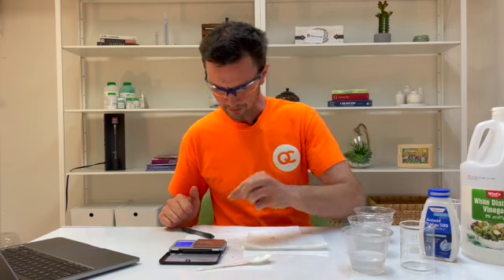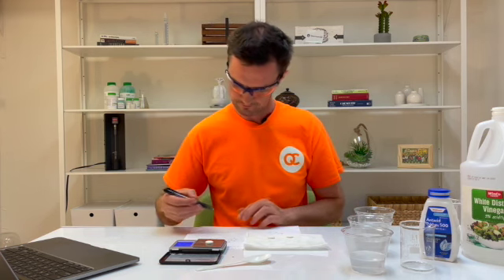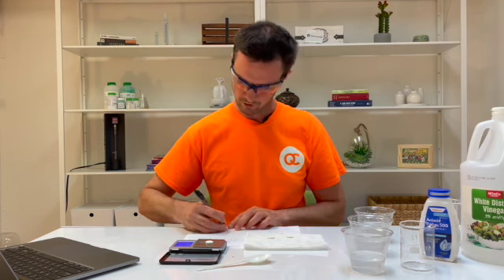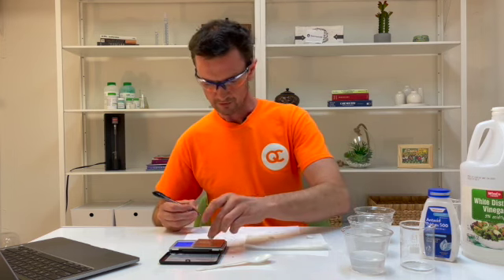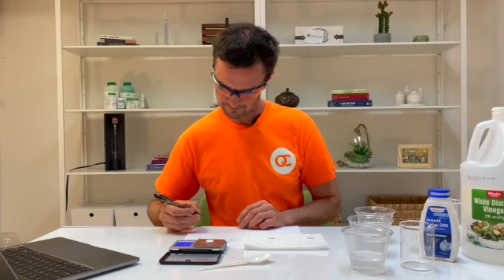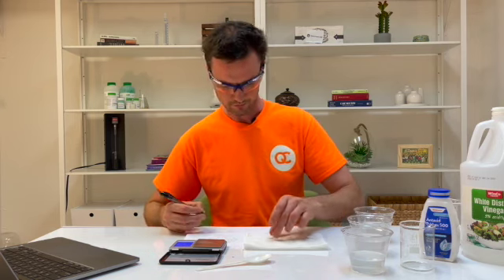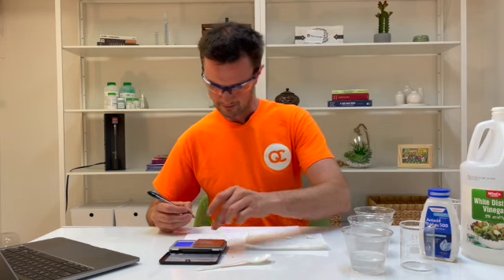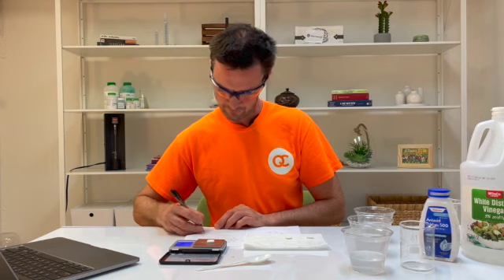I will weigh Tum number 1. That was in the most concentrated one. Got 1.15 grams. Let's weigh Tum number 2. 1.18 grams, a little bit more. And Tum number 3 is 1.25 grams. So there's my data. I will go ahead and run some calculations, and I'll be back in a moment.